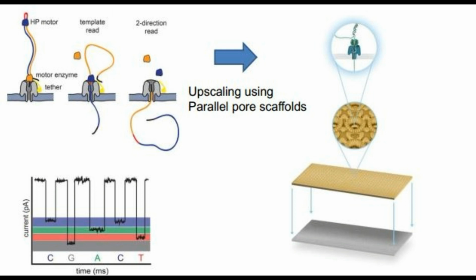The key difference of nanopore against all other technologies is that the nanopores appear to stream the data as DNA passes through them, hence making the data available for analysis in real time. And this has been used in clinical settings to identify viral strains in as little as 30 minutes from the start of the sequencing run.